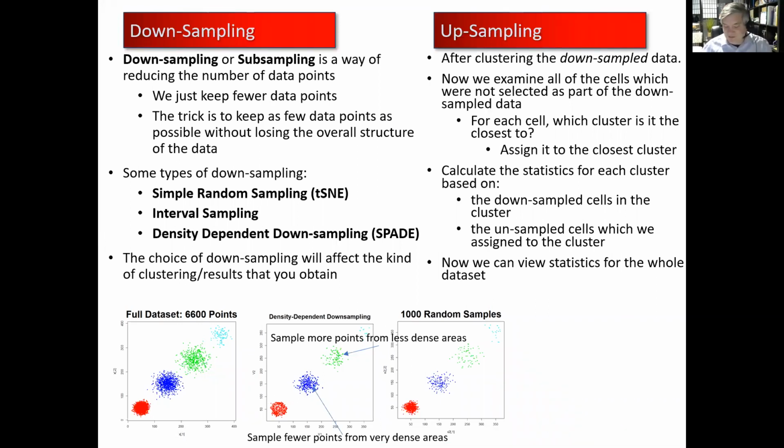Depending on your computer, I'm not saying FCS Express takes 3 days to run any of these. It's actually very, very fast. But if you could run 100,000 of those events and get the same or close enough results, and have that done in maybe an hour, it might not be worth 3 days running a million events.